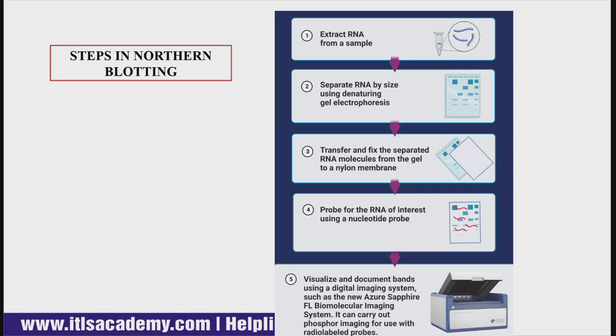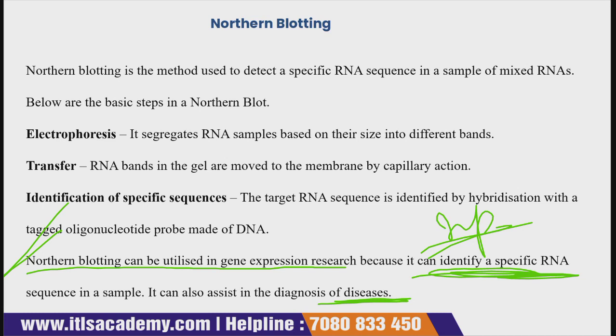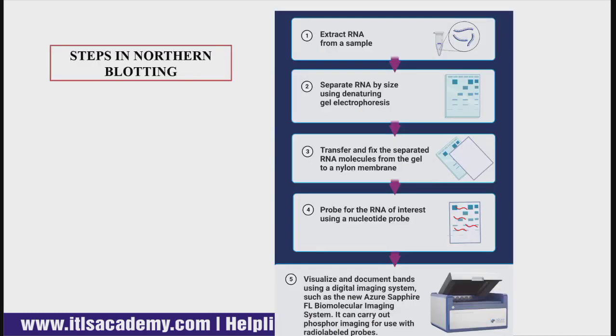Then further you probe for the RNA of interest using a nucleotide probe. Which type of probe? This oligonucleotide probe that is made up of DNA.